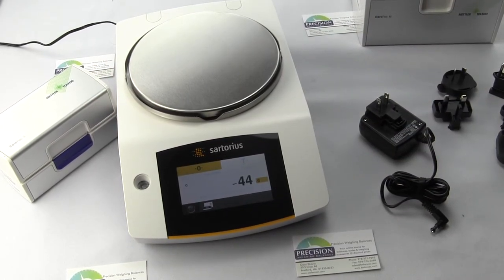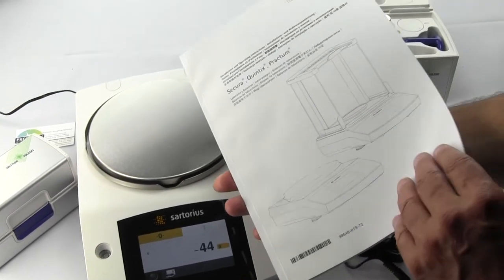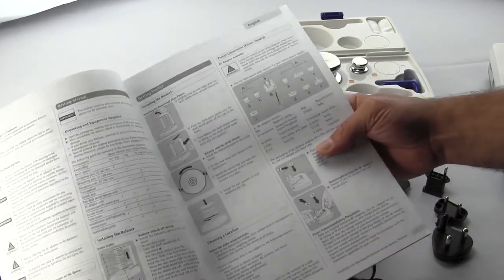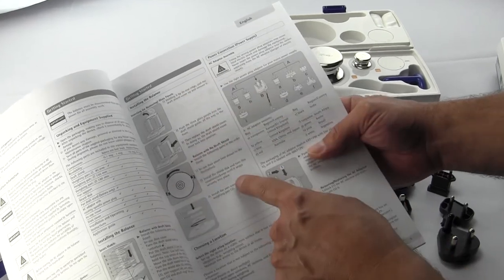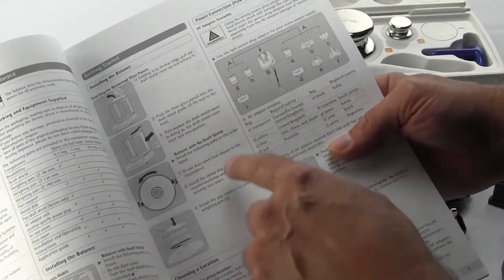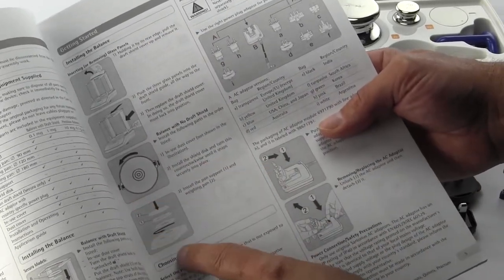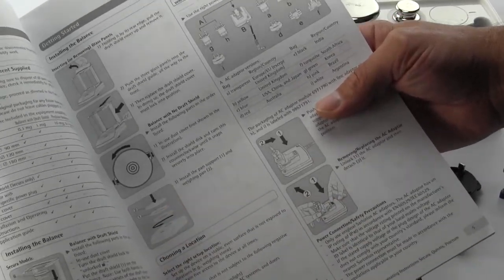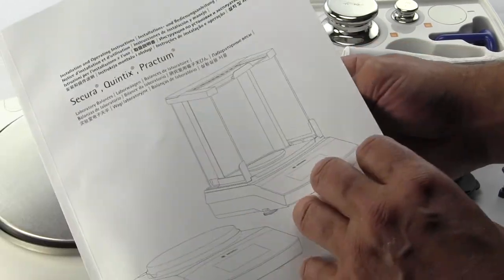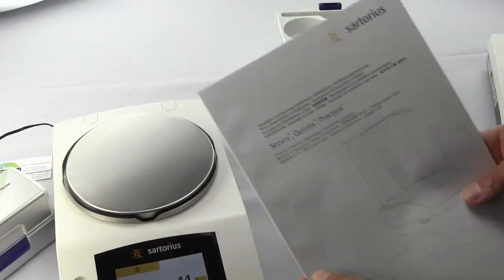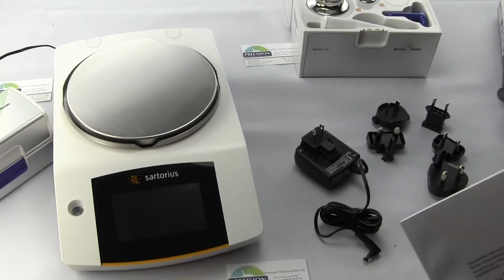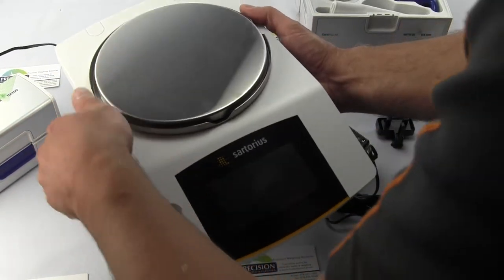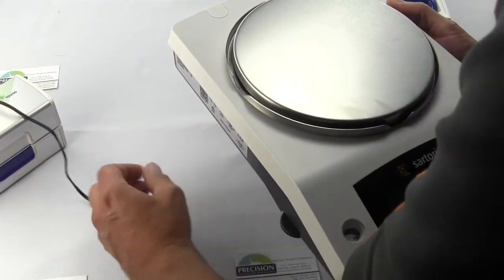Page five of the installation guide—this guide has great documentation Sartorius did for installing the balance and setup. This is for an analytical, this is the precision balance. The operation and instruction clearly shows you the assembly. I'm pointing out that Sartorius has great documentation with their product. The balance itself is extremely intuitive.